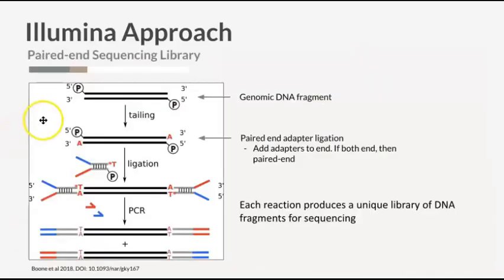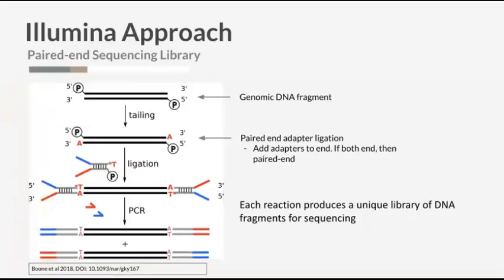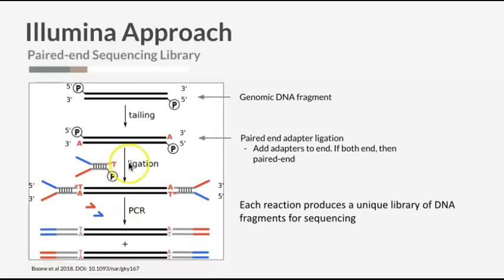Okay, let's move on to the next step, which is distinguishing again the difference between single end and pair end sequencing. So you have your fragment, and if you put adapters on both ends of your fragment, you will produce what's called pair-end sequencing. So pair-end sequencing means you have fragments on this side and on this side, right? You have adapters that you add on both sides. What's different between it versus single end is that with single end you end up with just this read right here.